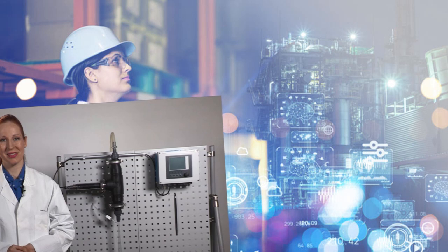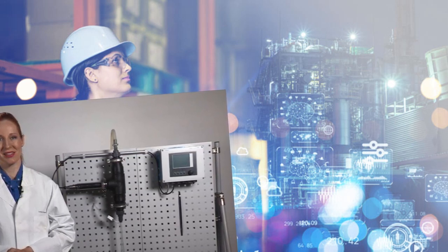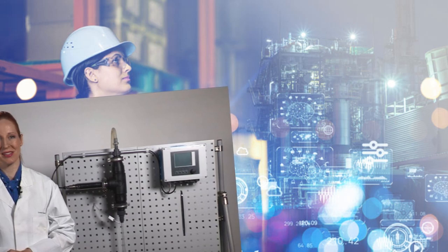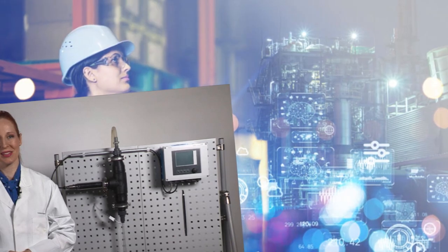Okay, so we're talking about making the invisible visible, right? Like we have this Turbimax CUS52D sensor. It's like the Sherlock Holmes of water quality, using this light scattering thing to solve the mystery. But honestly, I'm kind of picturing a laser show in a glass of water. Help me understand how this actually works.